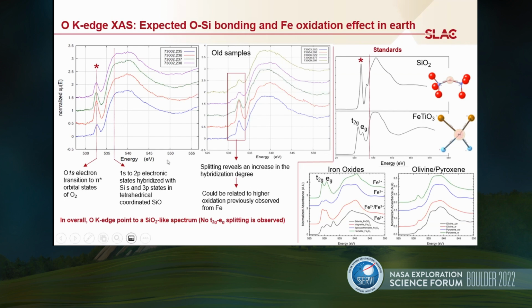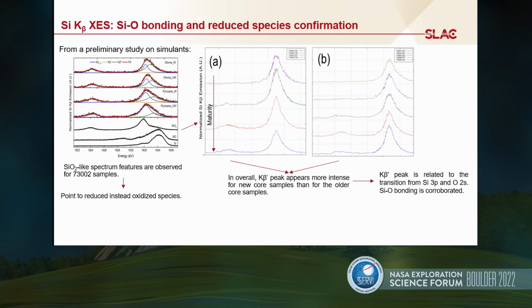So in conclusion, oxygen looks like it's pointing to a quartz-like spectrum signature, because we aren't observing this splitting. This is something that we were expecting, that we have silicates as our major component here.